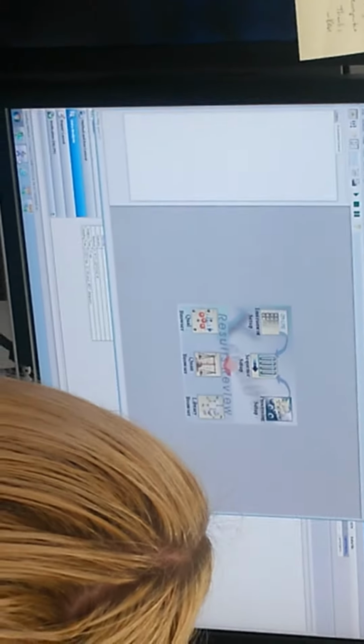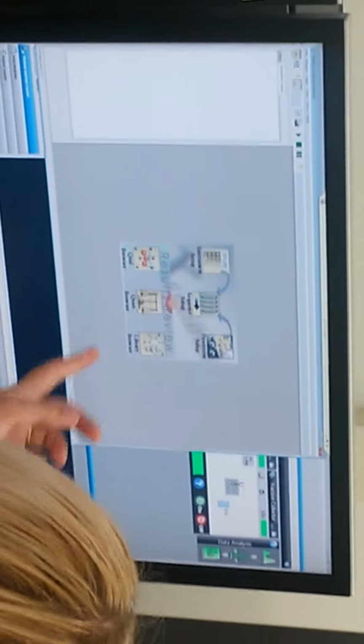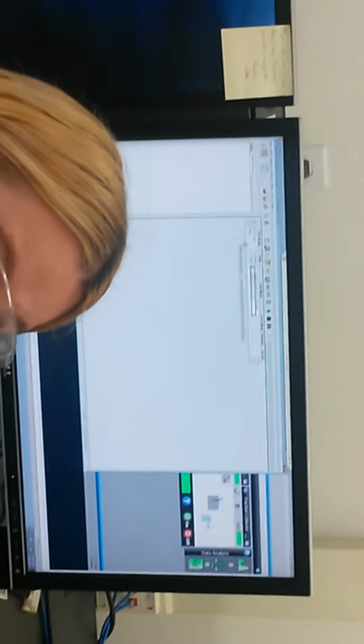Okay. So now we're going to actually do the setup for what you guys are going to be doing today. So the first thing you do is go over to Excalibur, which is this program right here, which is this X down here at the bottom. Okay. And I've already loaded the sequence setup for you, but you're going to click sequence setup, and it's going to be loaded here. The only thing you're going to change is instead of Mountain Dew Dr. Pepper test, you're going to put your name. So you're going to single click into here and change the name.